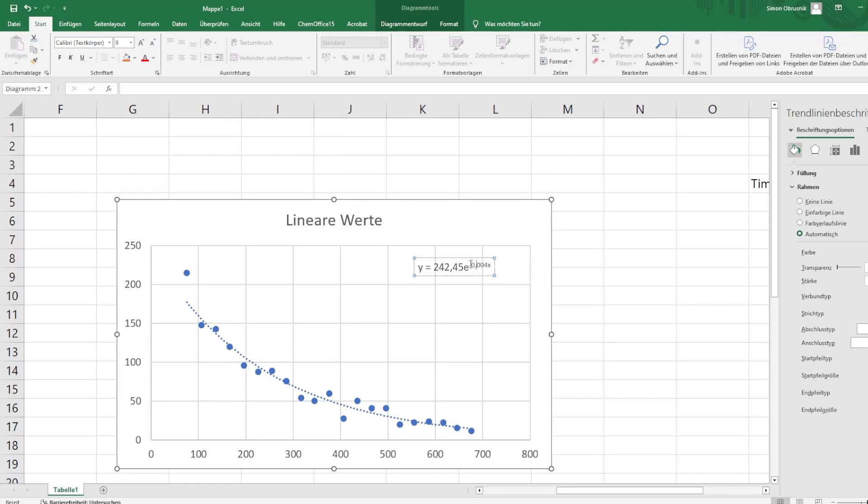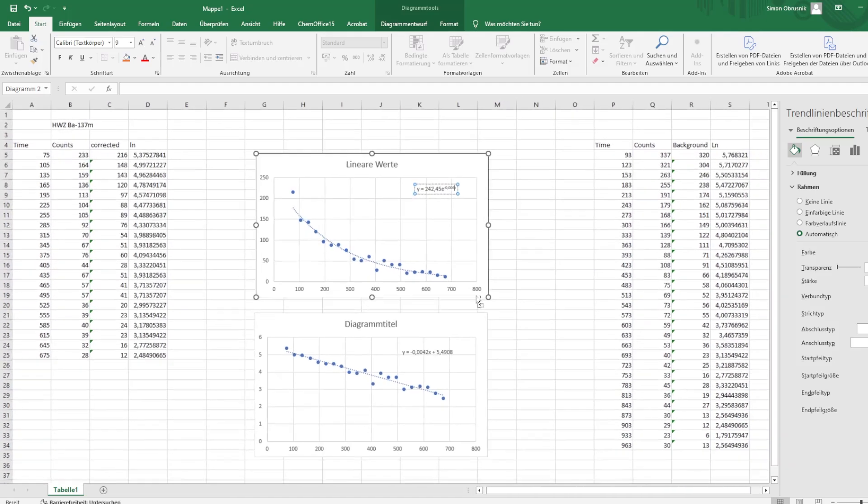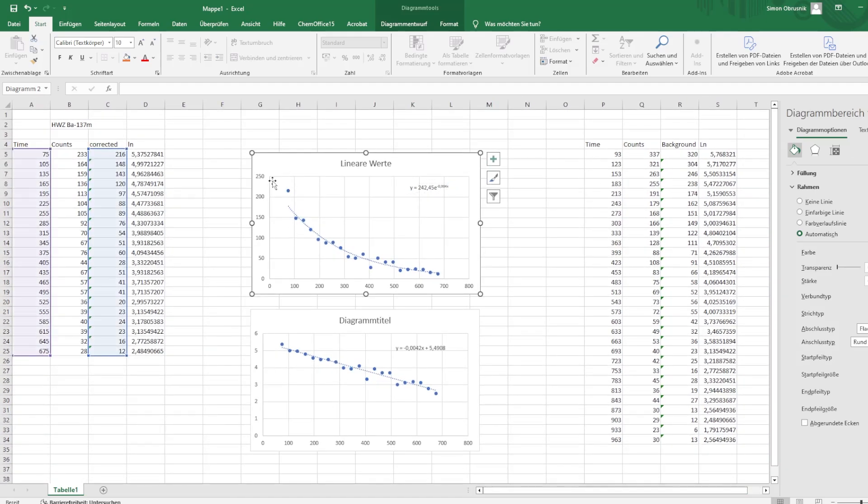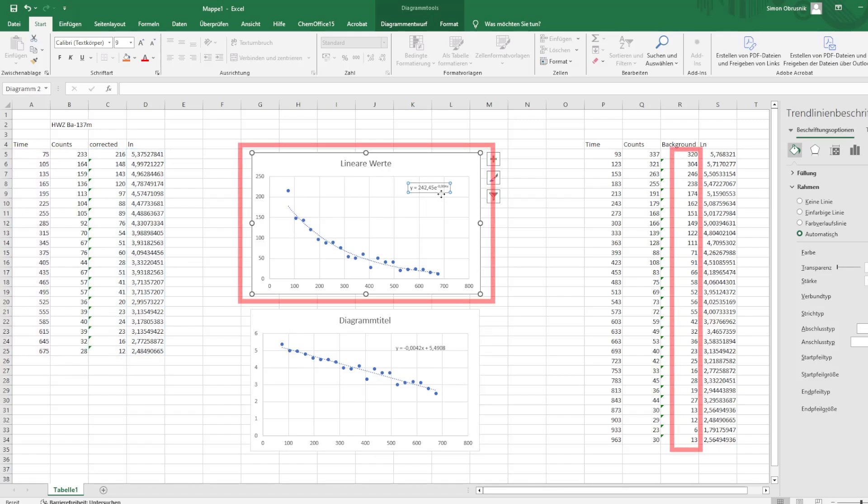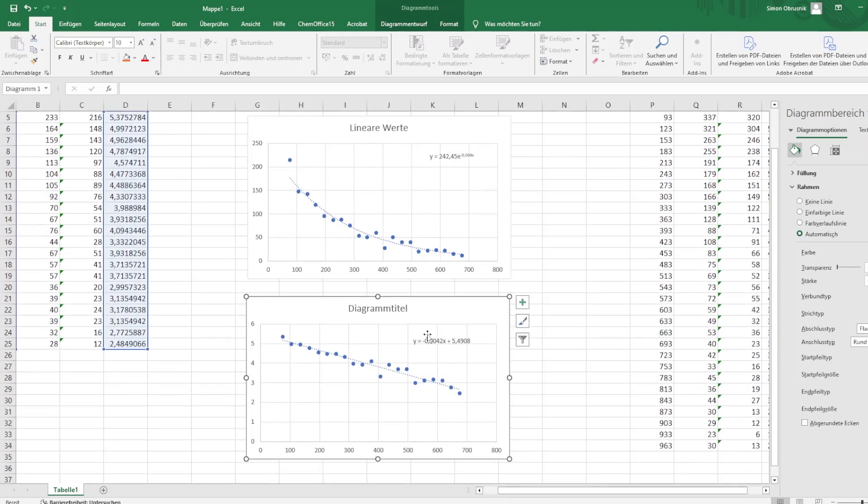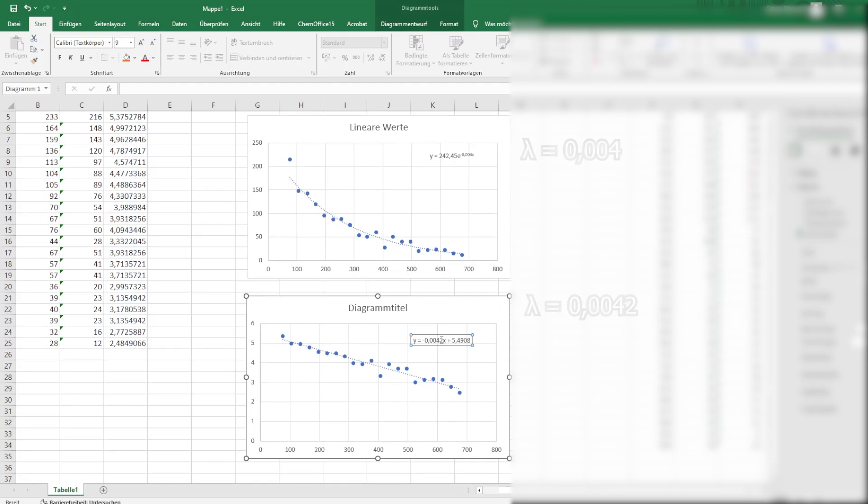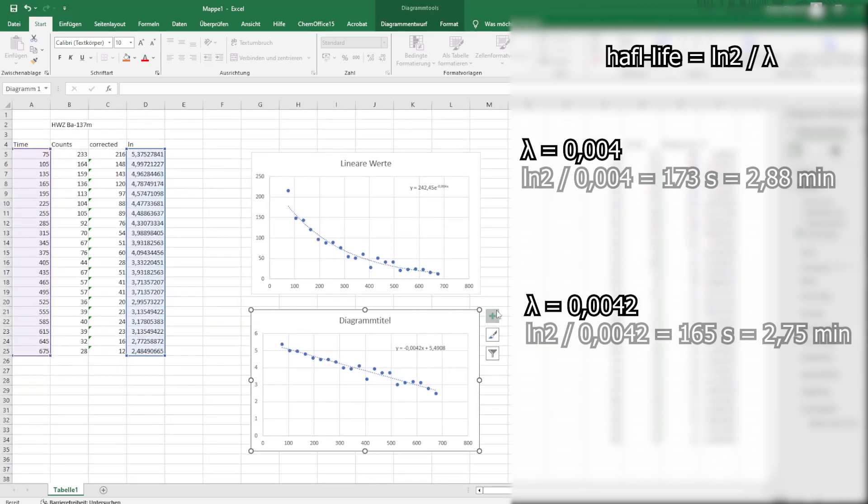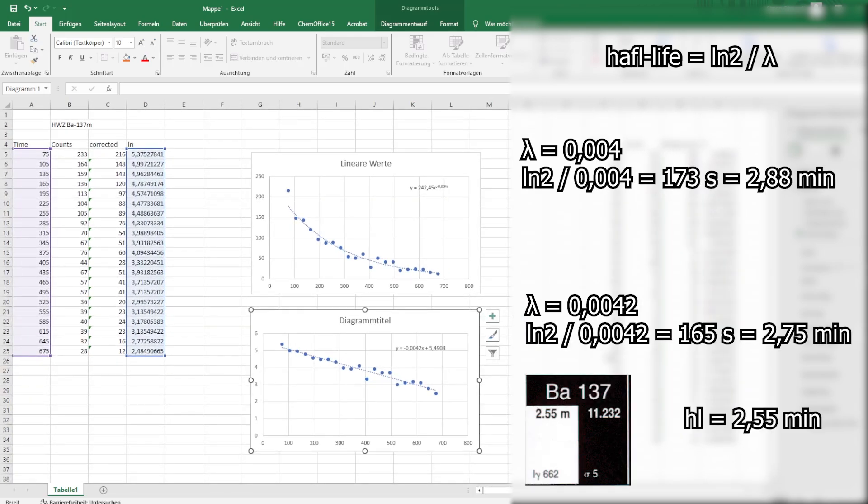Here's a prepared example from the second measurement run. Of course, some of you will use Origin. For those working with Excel, I just wanted to show you why using the logarithmic function is so important. Excel is notoriously bad at fitting exponential curves by default. When you display the linear equation, Excel only shows three decimal places. However, when you plot it logarithmically, the linear fit equation provides an additional decimal place. This number here is your decay constant lambda. Using the formula ln2 divided by lambda, you can calculate the half-life. I did this for both examples and compared the results to the literature. Can you see why this step is crucial?